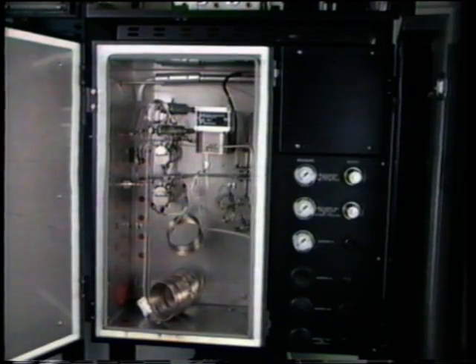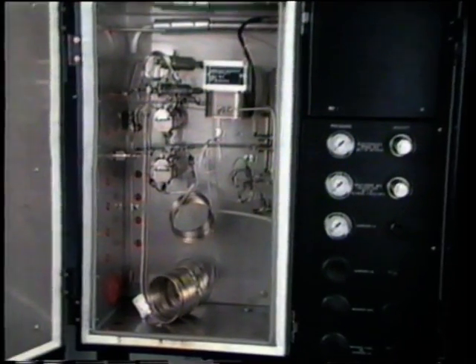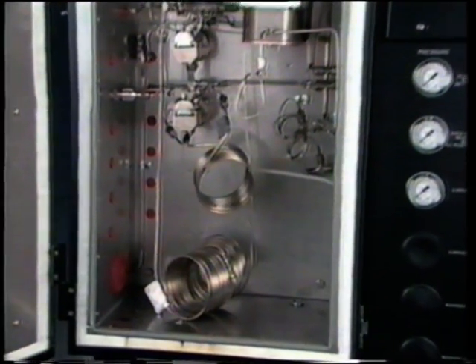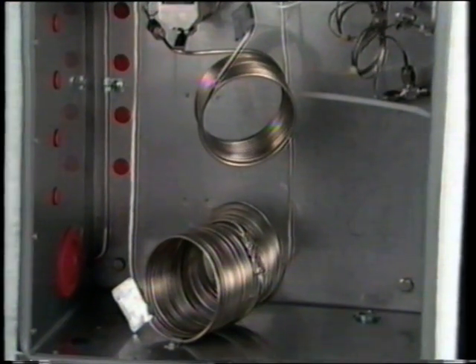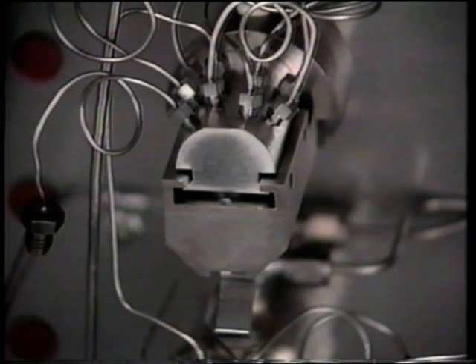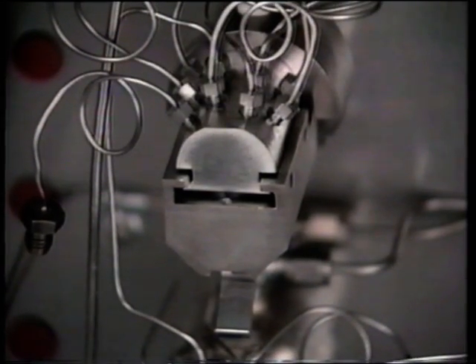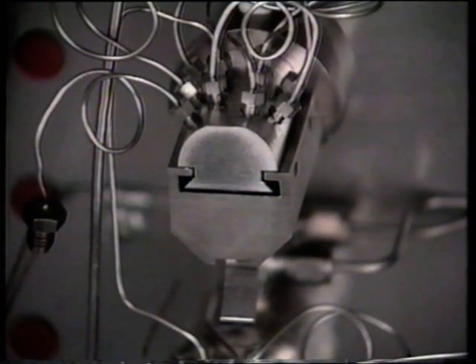More sophisticated analysis may require column switching systems that use multiple columns and column valves. One column provides a partial separation, while another column completes the separation for a detailed analysis. The use of additional columns can reduce the total analysis time and prevent column contamination. Column valves route the sample and carrier through alternate paths inside the chromatograph at different times in the analysis.